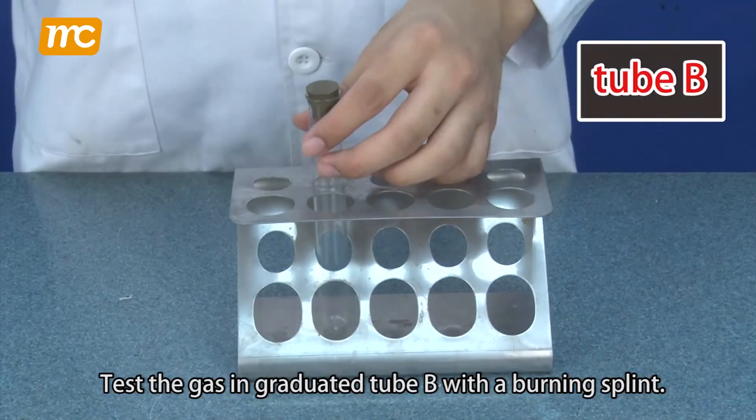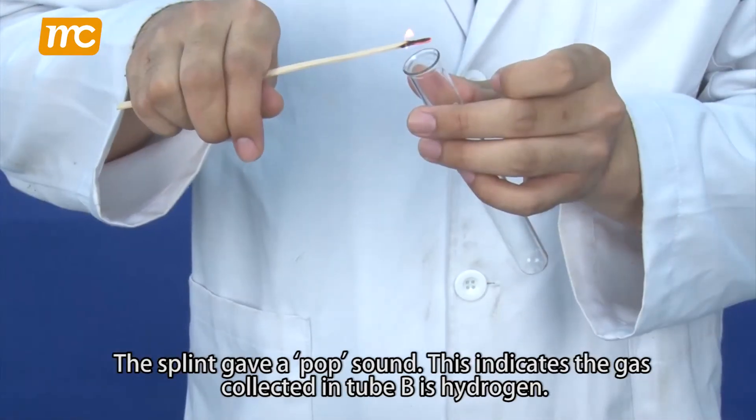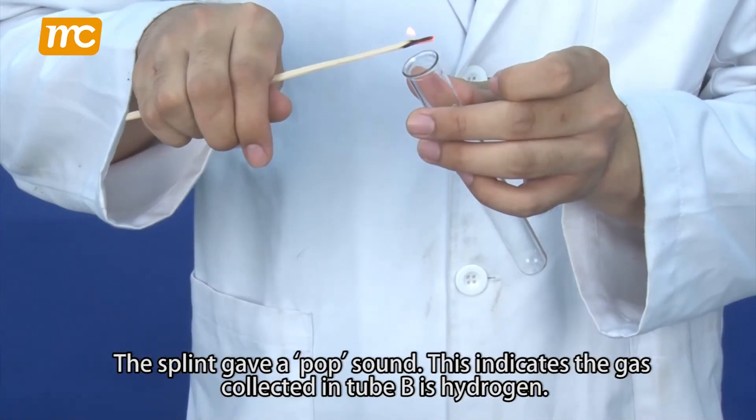Test the gas in graduated tube B with a burning splint. The splint gave a pop sound. This indicates the gas collected in tube B is hydrogen.